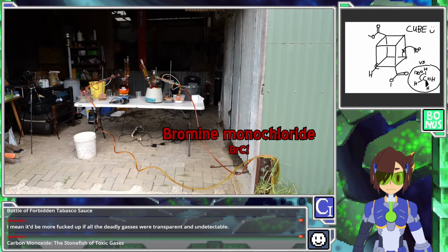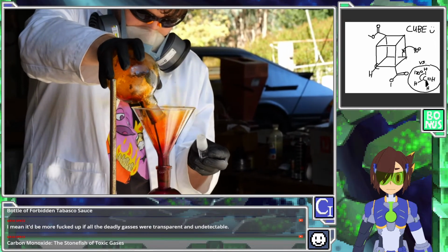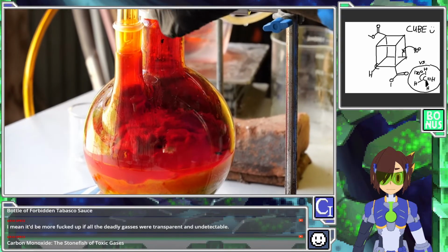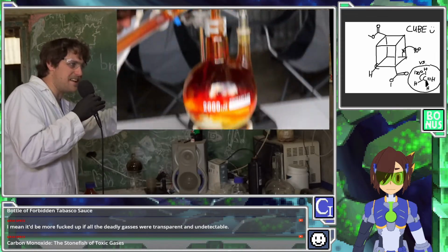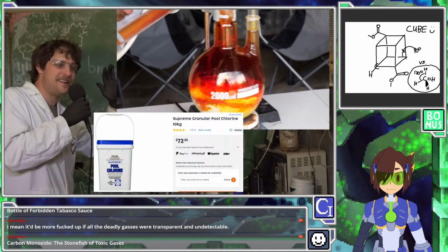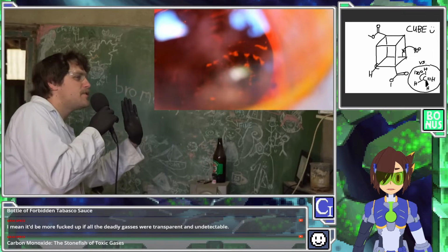And you'll lose some yield to that, and you also contaminate your bromine with this bromine-chlorine molecule. However, you've got to remember we weren't prioritizing yield or purity. We were aiming for that 1 liter, so what we were actually prioritizing was speed, ease of doing it, and also cost, because you can buy a lot of calcium hypochlorite very cheap. So we optimized for speed and cost rather than yield, which, looking back, maybe not a good idea.